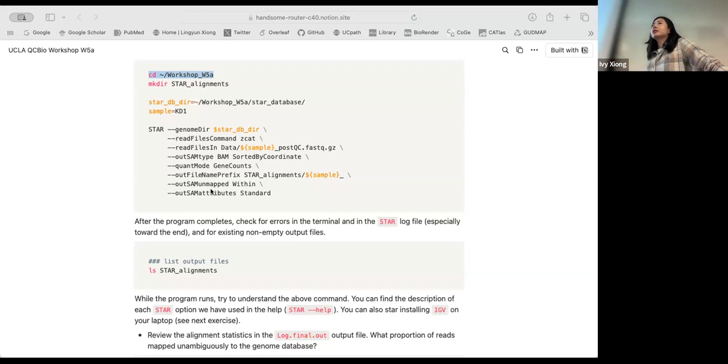For single cell sequencing analysis, it does become a problem. But for bulk sequencing, 4 is typically fine. Sometimes I use 8 for large samples, like some samples that have more depth in reading.